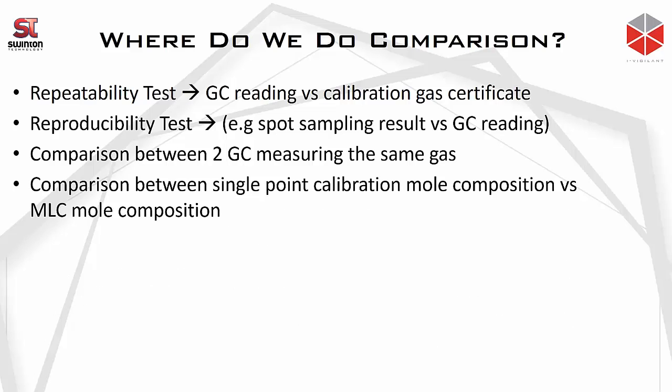And the last place where we do the data comparison is to compare the single point calibration mole composition versus the multi-level calibration mole composition. This is a very useful exercise to make sure that the calibration gas that we use is appropriate for the particular pipeline composition. A wrong calibration gas design will result in quite a significant bias that will impact the measurement.